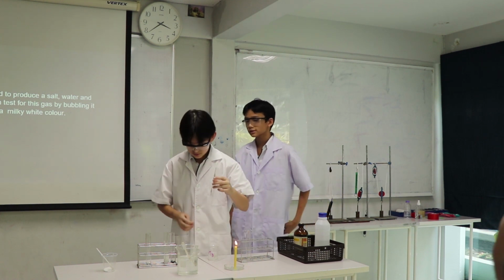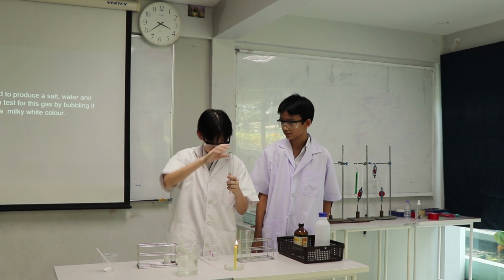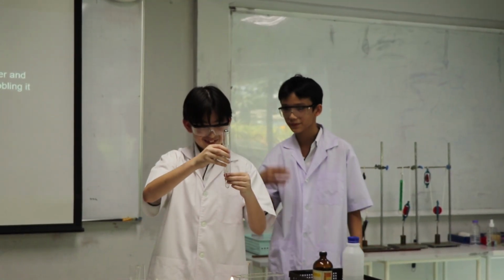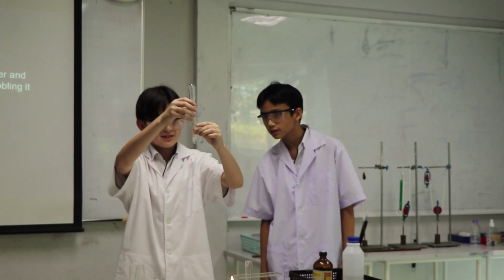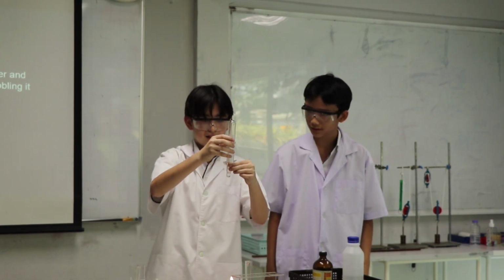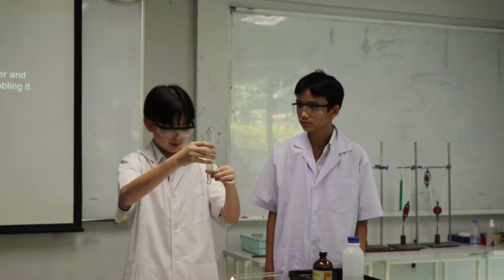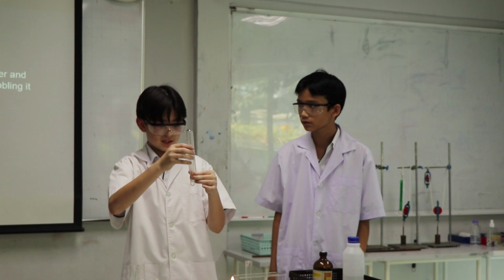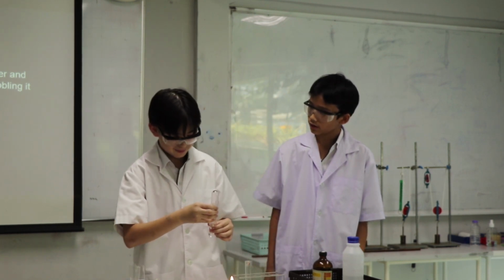Now we're collecting the hydrogen again because last time it didn't work. As you can see, it is fizzing. It's bubbling. Right now, it's making hydrogen gas, and we're trapping it in this boiling tube, and then in approximately 15 seconds, we're going to put it on display, and hopefully it will make a popping noise.